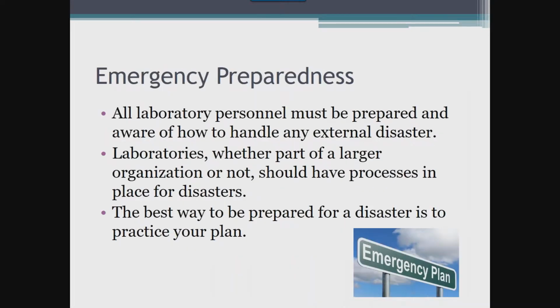There are many emergent situations that can occur and impact our laboratories. Depending on where your laboratory is situated, these situations likely vary. Emergent situations can include tornado, vehicular accidents, hurricanes, earthquakes, snowfall, use or presence of weapons or active shooters. Policies should be in place to address these kinds of situations as applicable to your facilities.